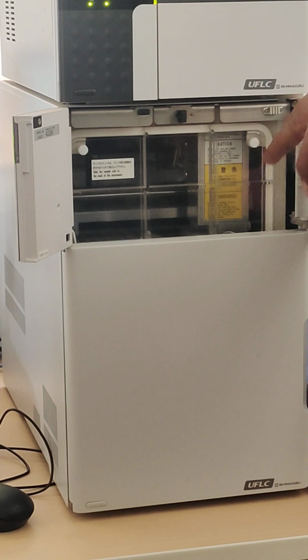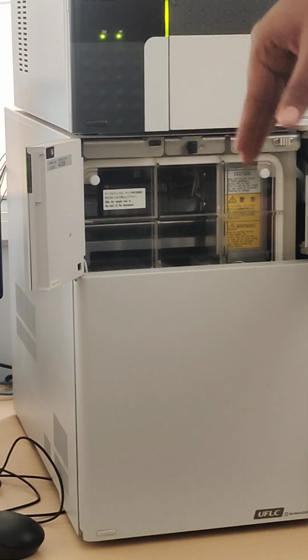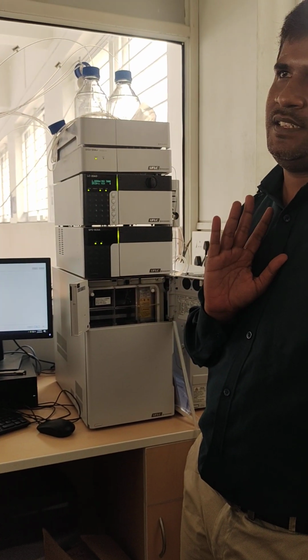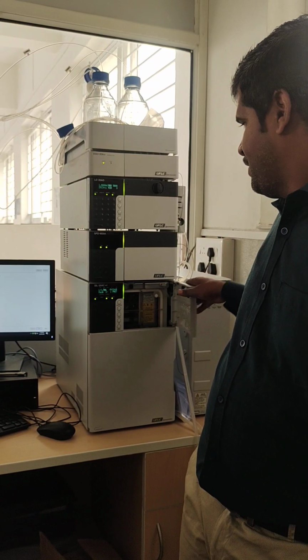Now again coming to the original. And then the second sample will be taken. At that time they will rinse. They will take the second one, push it into the column, and again come to the original position. Before taking the sample they will rinse. After taking the sample they will not rinse it. Isn't it? This is the system of the injector.